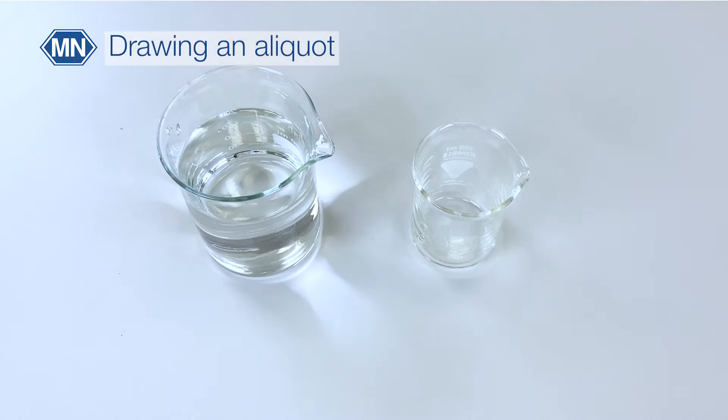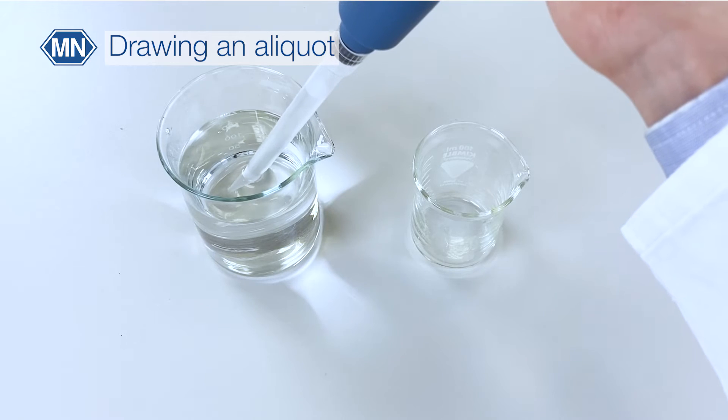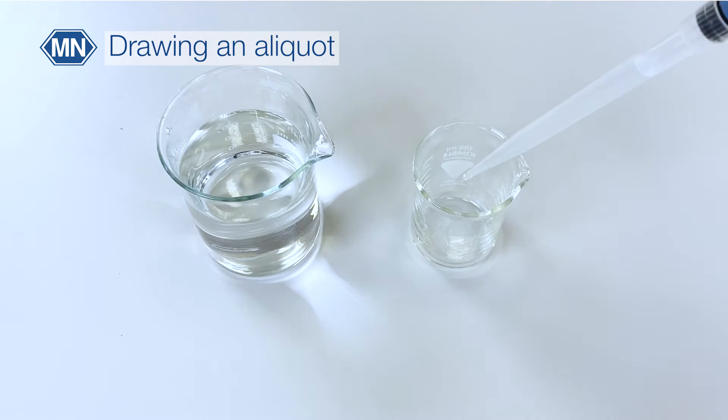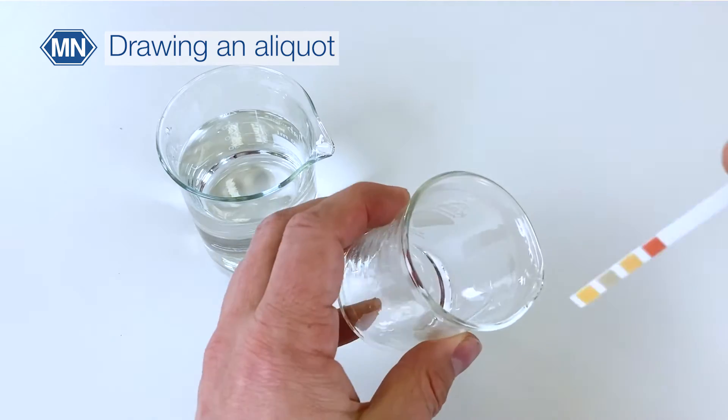In general, the best practice is to draw an aliquot of the sample and then test the pH in this aliquot.